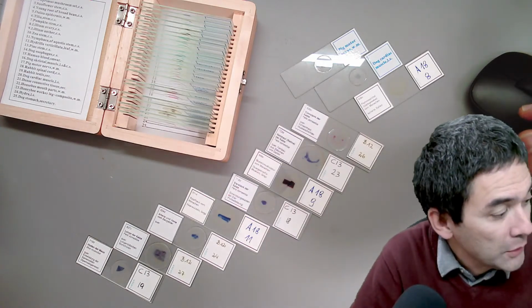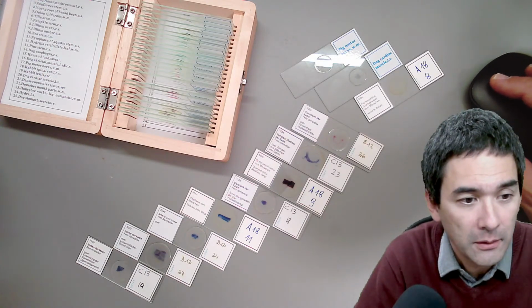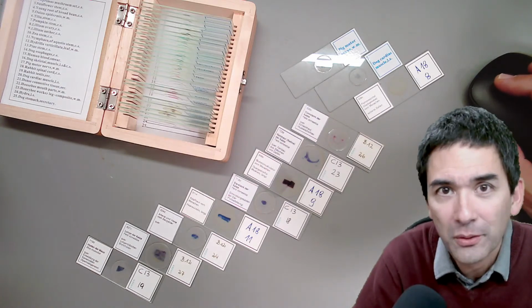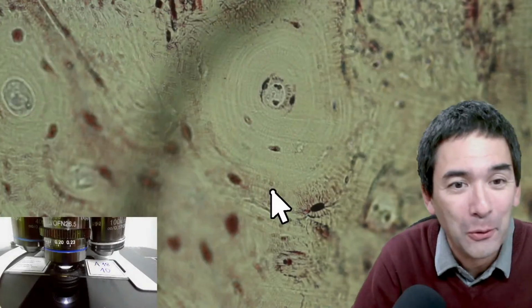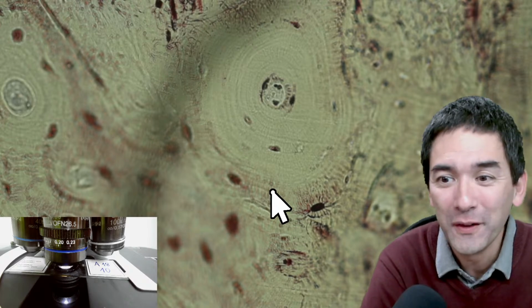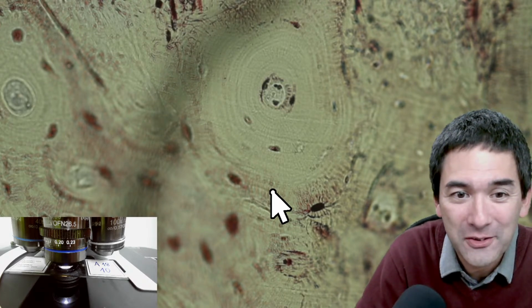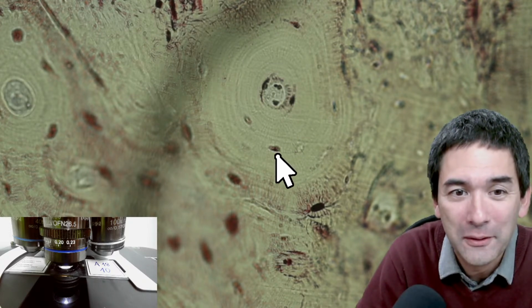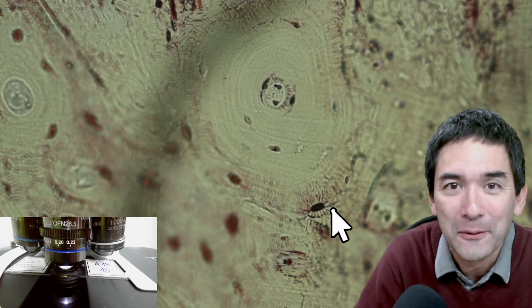What I'm going to do is simply show you a few things, so I'm going to switch over to the microscope view, and if you have any questions, you're welcome to ask them. No guarantee that I'm able to respond to all of those questions, but I'll try my best. There's one thing that's a little bit new this time, and look, what do I have over here? There's an arrow, and I'm now able to move an arrow around to point towards the different parts. I think this makes life a lot easier.